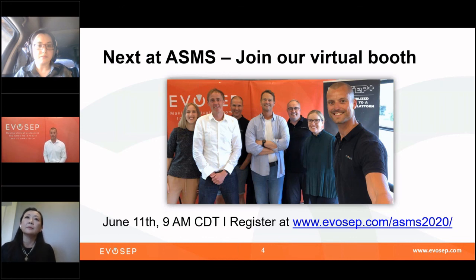Unfortunately, as I said earlier, Gary had to leave. But my take on this is two things. I think dia-PASEF and the DIA technologies in general have really improved a lot. But also having the more robust chromatography really allows us to take full advantage. And I think this is what adds to the reproducibility in these data sets.